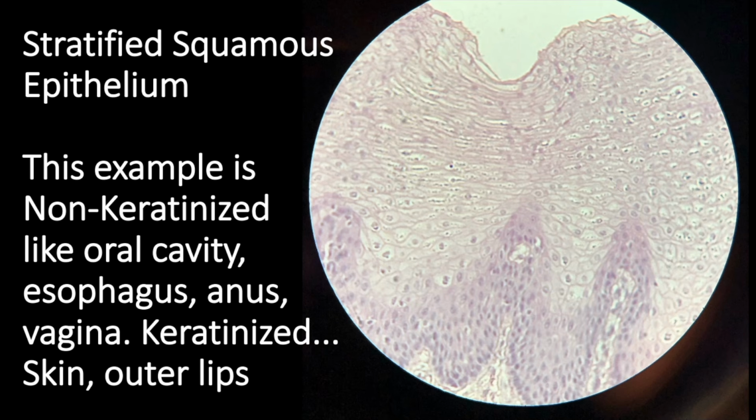How can you tell, or what would it look like if it's keratinized? Well, all of this up here, you won't find any nuclei. Dead skin. That's why it doesn't hurt when your skin sloughs off, because those cells are not living. But these are living, and we can tell that because you see nuclei all the way up through.